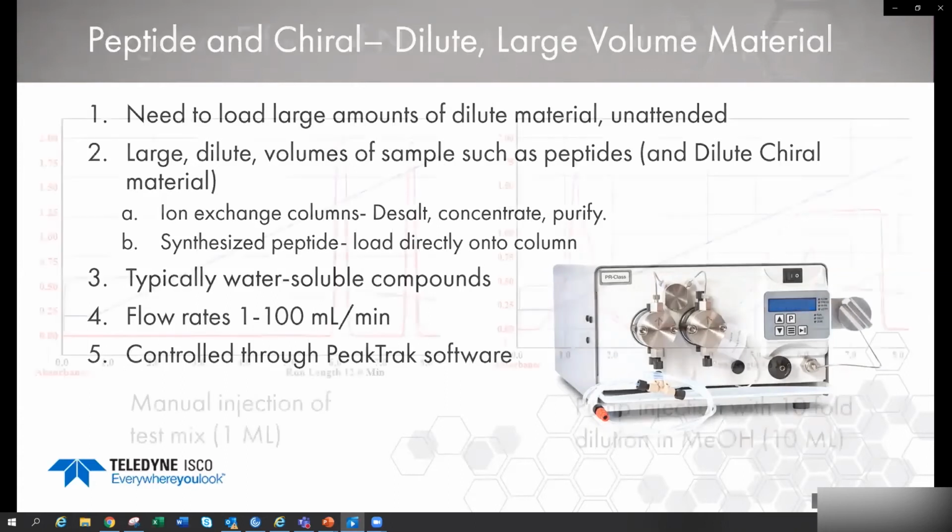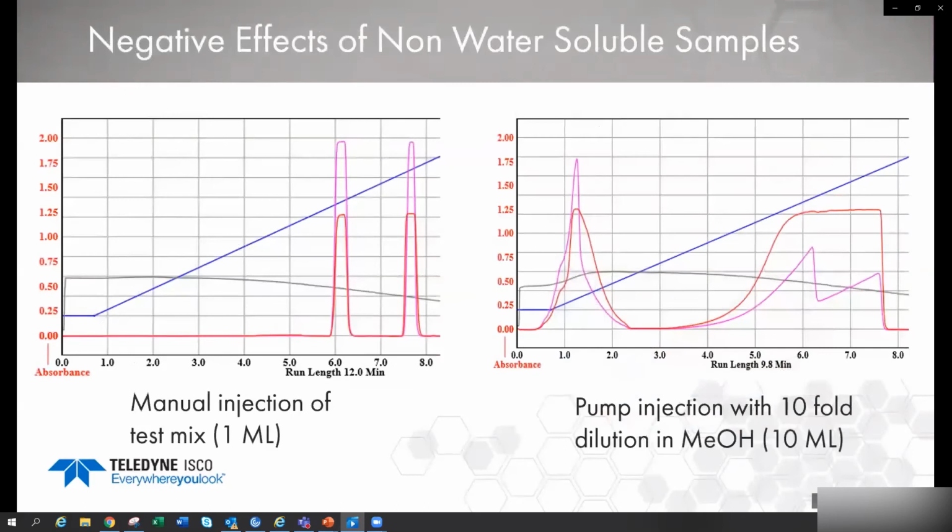In this case, I set up an injection for a peptide customer of ours. The first compound, we had 2 different components. As you can see, it's fairly good resolution. I would go ahead and run with this. It's not too bad. But the problem is, if we try to load up that same amount of material with a large injection, we go from a decent resolution to something where there is no way you can get it pure. We can get the back peak to be a little bit pure, but your first component is never going to be pure.